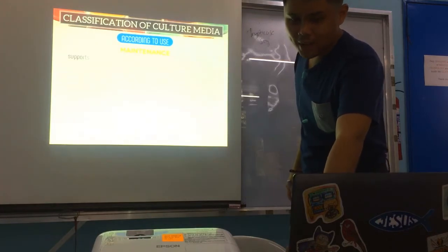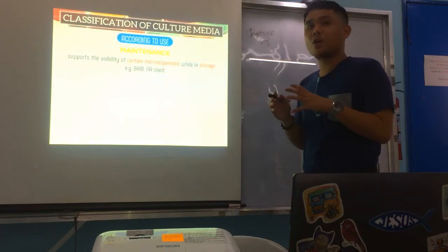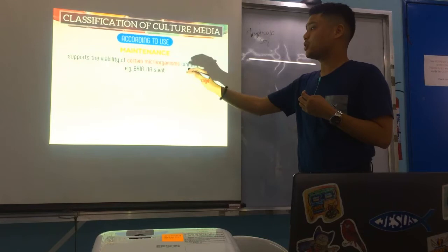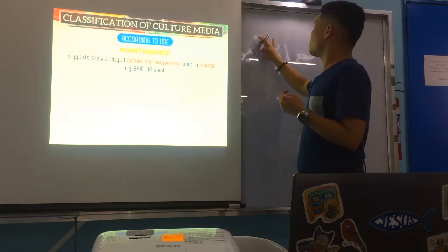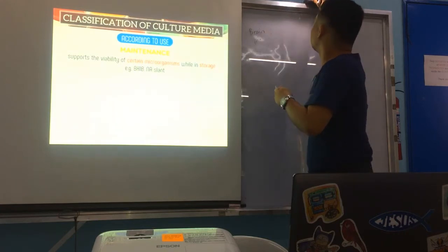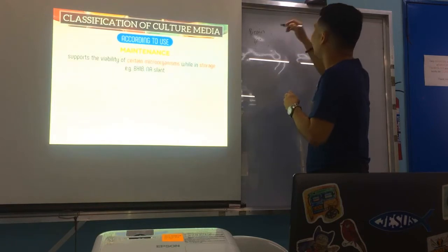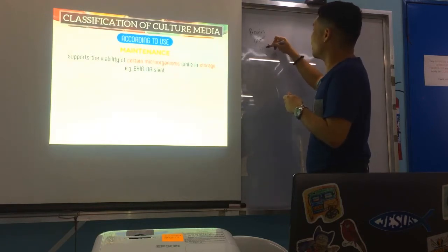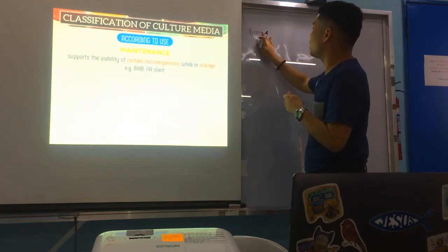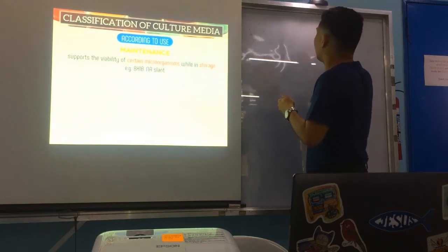Okay. Next, we have maintenance. By the name itself, maintenance. It supports the growth of microorganisms for future purposes or while in storage. Okay. And a very good example is BHIB. BHIB stands for brain heart infusion broth. And NA, nutrient agar slant.